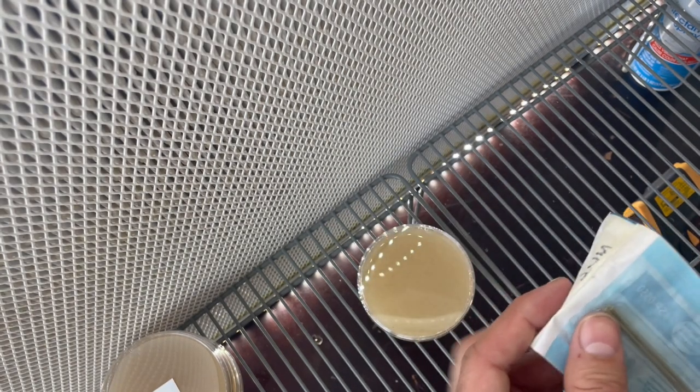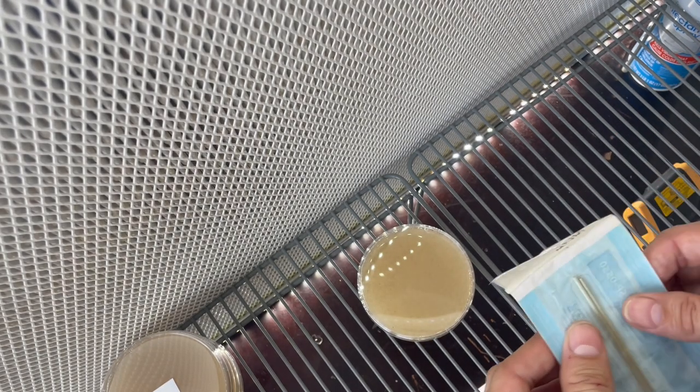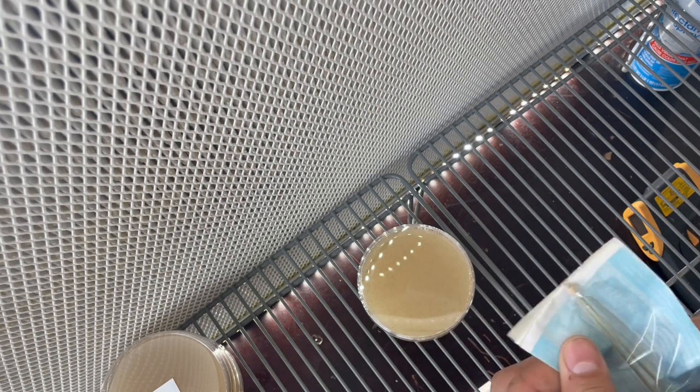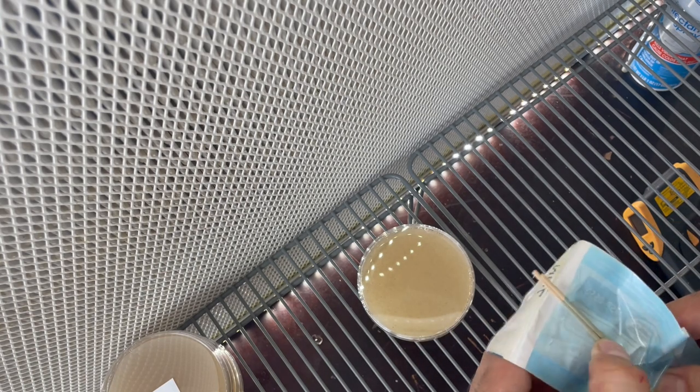We'll always spray down our packaging with Lysol. We'll always run our flow hood for 30 minutes, always wear a mask, and always try to mind yourself — don't even talk. If you have people around you, just ignore them until you're done.